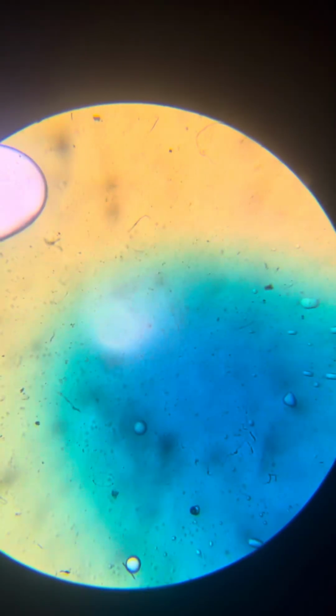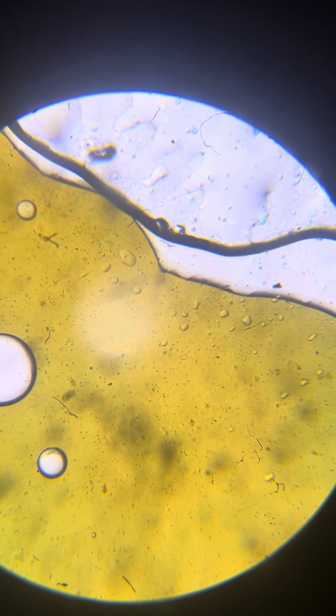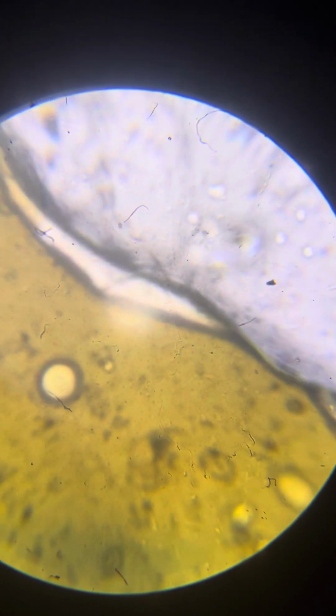I mean, we don't see a very definitive, I would say, train-like object. Here we see more of the kind. This is more like, not impressive ones, but we do see some trains, definitely.